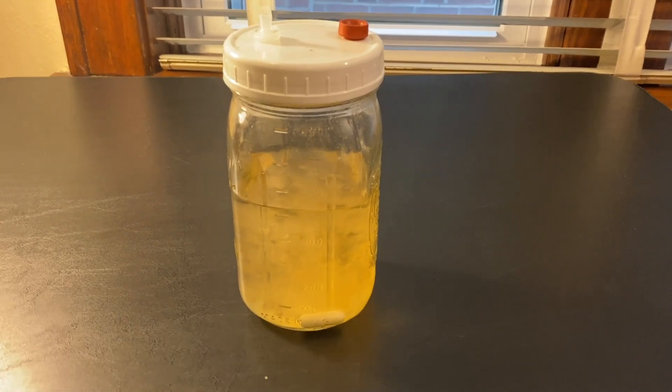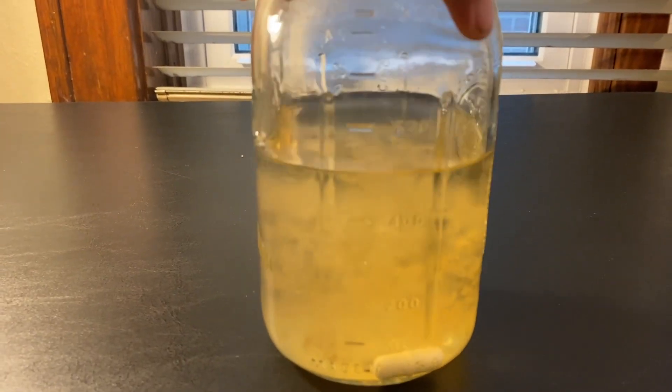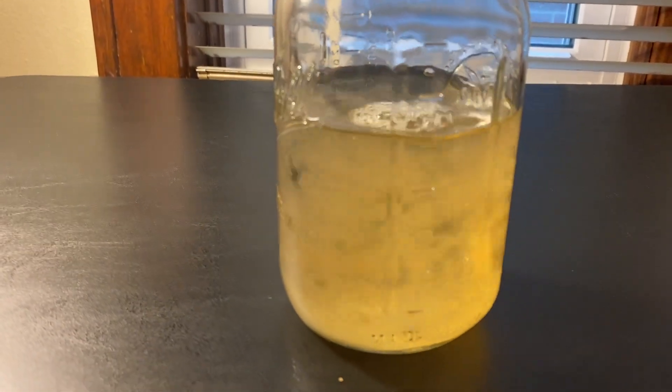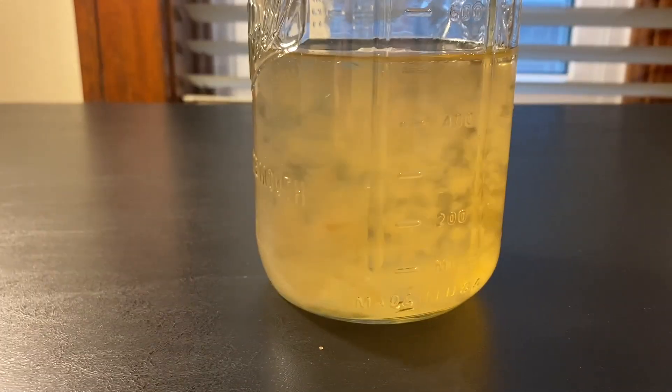Hi, Ashley here, and today I'm going to show you how to make liquid culture. Liquid culture is a great way to speed up colonization and preserve genetics. One downside to LCs is you can't see contamination, so checking viability on agar is best.